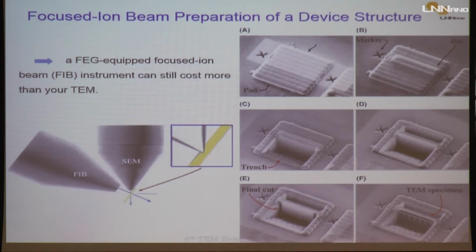I will show a video in the next slide about it. I will just go very quickly here. First, you need to prepare a pad of platinum on the surface of your material. Actually, you can choose different metal sources, but we used to use platinum. It's most conventional.